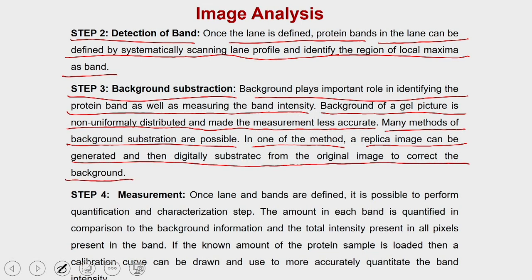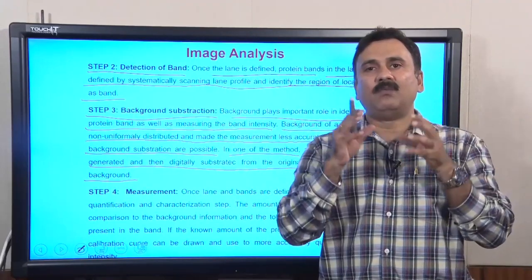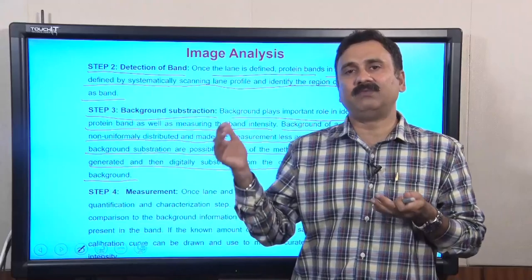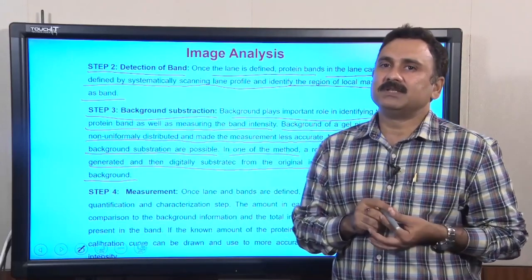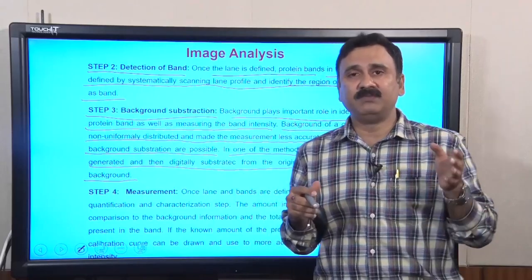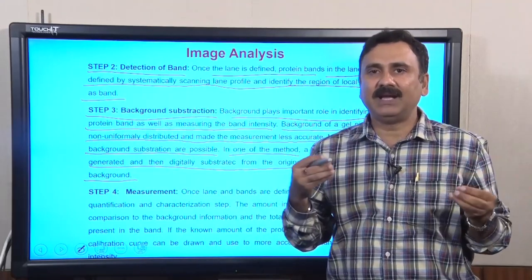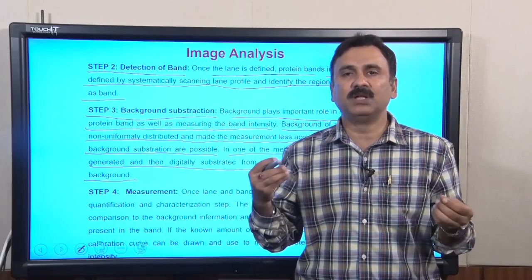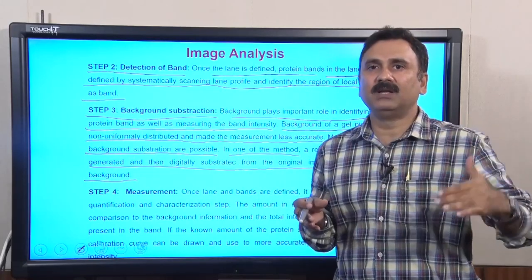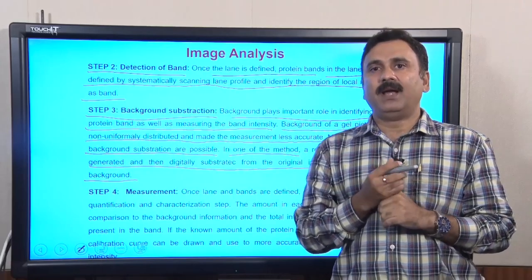So the background is very important. If the background is very high or very low, that is going to decide the shape of a particular band and its intensity, because all the intensities are going to be calculated based on the background. So if your background is very high, the image analysis is going to be less and less accurate. More important is if the background is non-uniform, which means in some lanes it is on the lower side, in some lanes it is on the higher side. Because of that, you will have difficulty choosing what background to subtract. In those cases, if you go with the higher background, you are going to cut the signal from the proteins which are closer to the lower background signal, and so on.